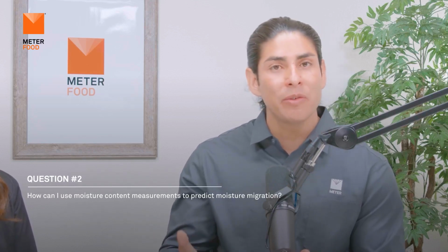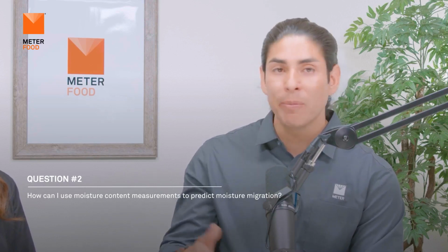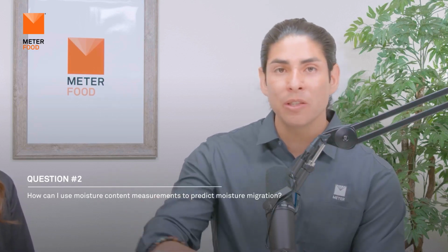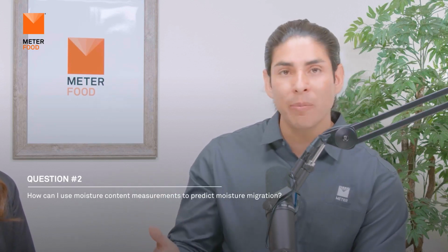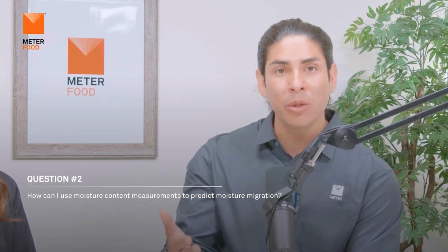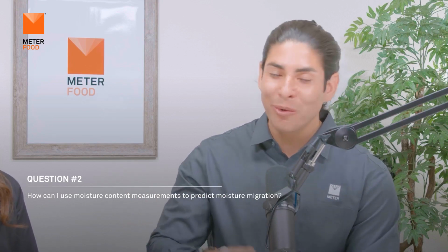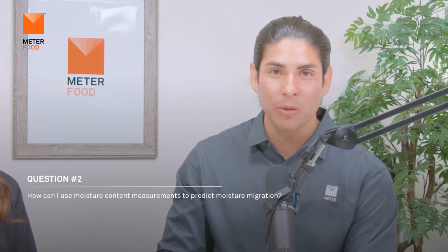But what I hope that we've shown in this webinar is that it's really the water activity that you need to keep in mind. The water activity is a measure of the energy of that water, and it dictates which way the water wants to move. Water always wants to move from a high energy state to a low energy state. So in the example that we looked at, by understanding that the water activity is higher in the blueberries, that water wants to move from the blueberry towards the almond to reach an equilibrium. So don't worry about moisture content. Focus on water activity if you were thinking about moisture migration.